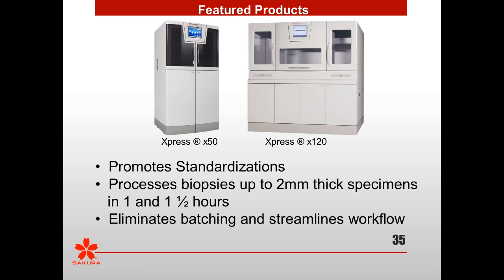There isn't really a good accepted protocol for reprocessing tissue. One of the things that we have found is that if we happen to have somebody put in something thick and we do not get it accurately processed, one technique that we're using is that we let that tissue come to room temperature in the paraffin as much as we can, and then have a PA trim that paraffin tissue before we move it backwards into removing paraffin, then moving it to alcohol, and then moving it forward again.